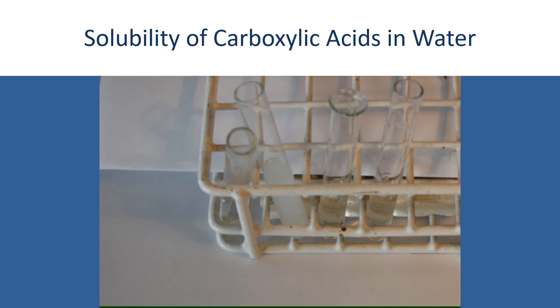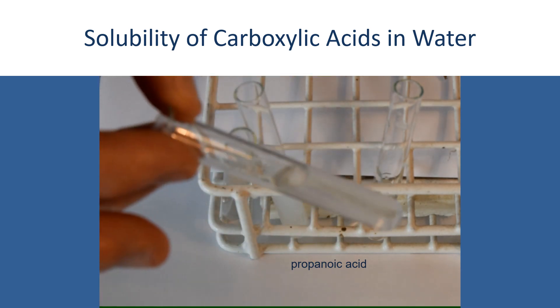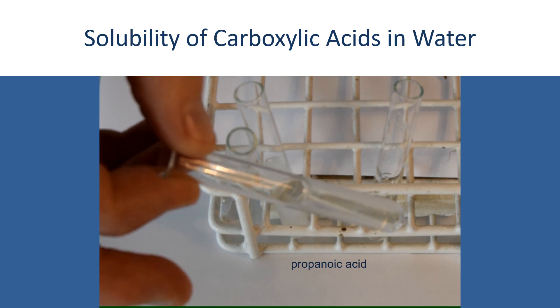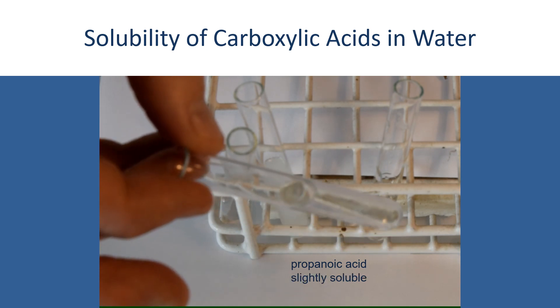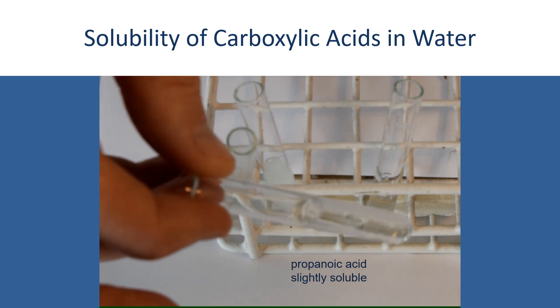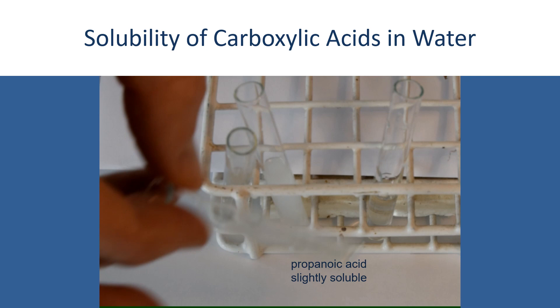If I now go to propanoic acid, I'm going to add some propanoic acid to the water. You can probably see in the camera there it's becoming less miscible. There are bubbles of the propanoic acid — it looks like bubbles, but it's actually droplets of the liquid as it's becoming less miscible in the water.